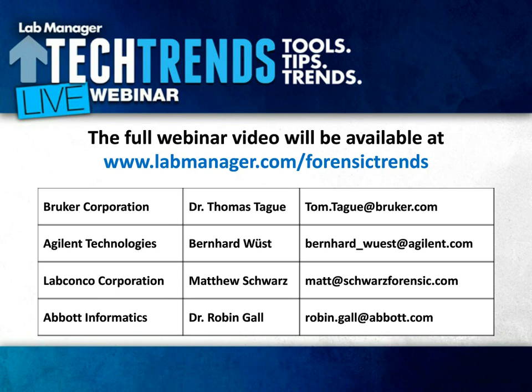Great, thank you. And are FTIR and Raman analyses admissible in a court of law? They are, and there have been many precedents that have been set where usually if you say you've used infrared or Raman spectroscopy, both the attorneys on both sides will recognize them as well-validated techniques.